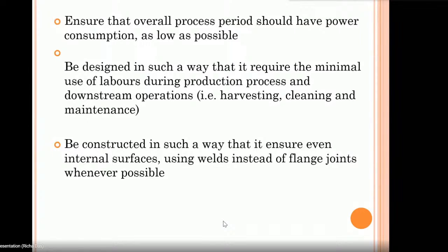That is why I have to buy a fully automatic fermenter that operates itself. Nowadays various sensors are fitted into the fermenter: temperature sensors, pH sensors, and oxygen sensors. So in the fermenters available in the market nowadays, manual power is not at all required. That is how my ideal fermenter should be.